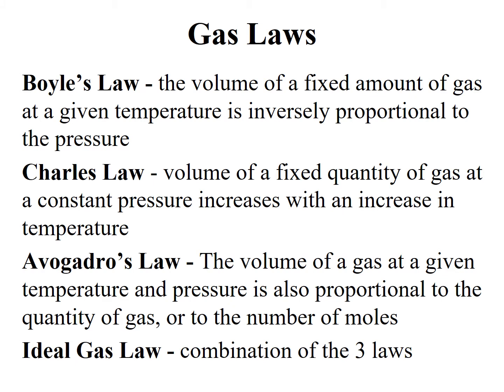In this experiment, we're going to deal with gas laws. As discussed in the lecture, we said that gas can be described by at least 4 experimental variables: the moles, the temperature, the pressure, and the volume. Now, these variables were first studied by different scientists.